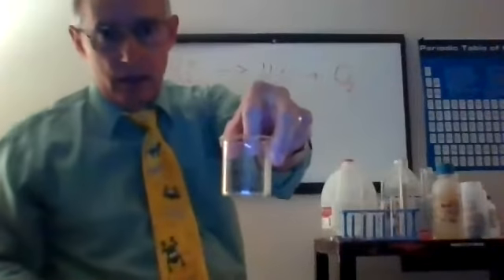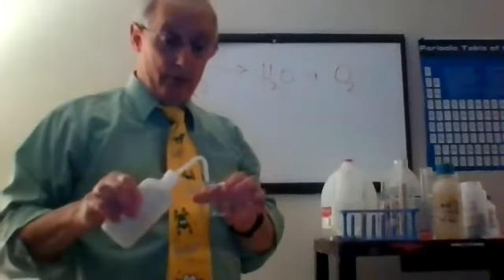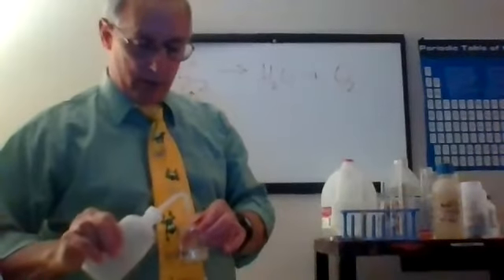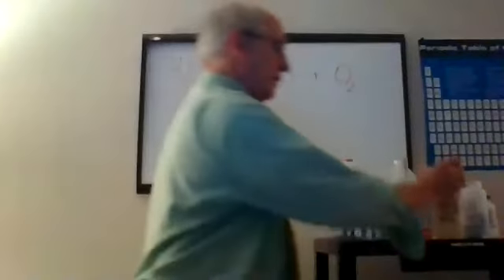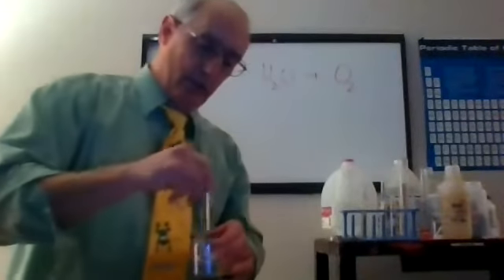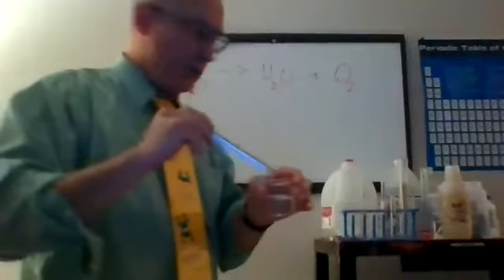This one is zinc and hydrochloric acid. Now let's take a look here. We're going to go ahead and put some water in there. You always put the water in first, not the acid. And then you put the acid on top of that. Let's put a little bit more water. And then let's put some 12 molar hydrochloric acid. Just a little bit, just a little slush. Okay? Now that's not real exacting, is it? Forgot to bring home my glass stirring rods.